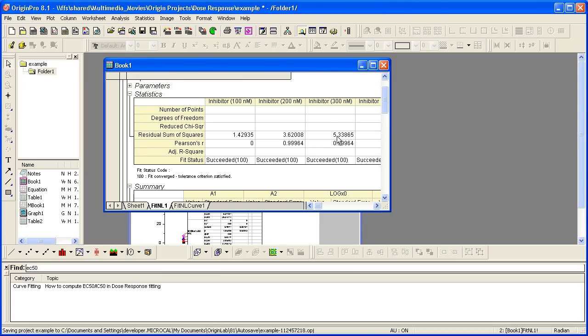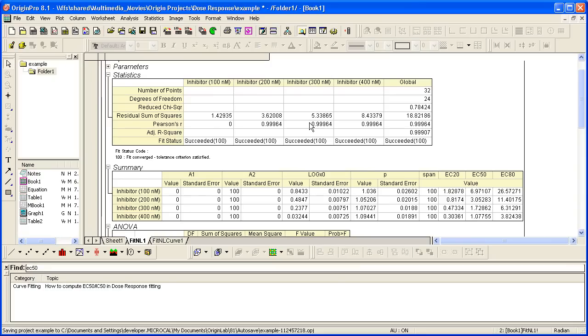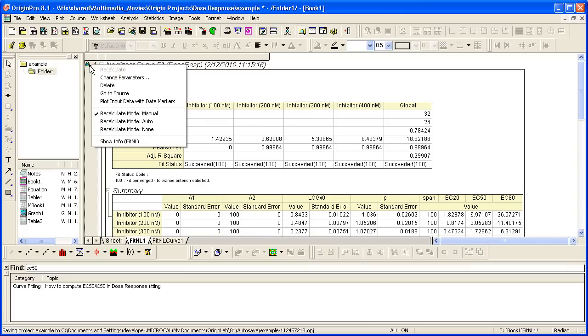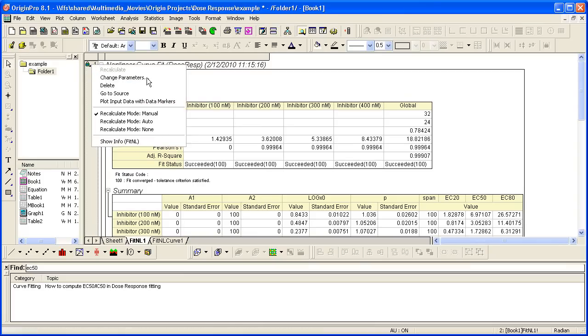If I go back here and I look at the results, I want to add that EC90 to my table. So what I do is I click on the lock, which allows me to change parameters.